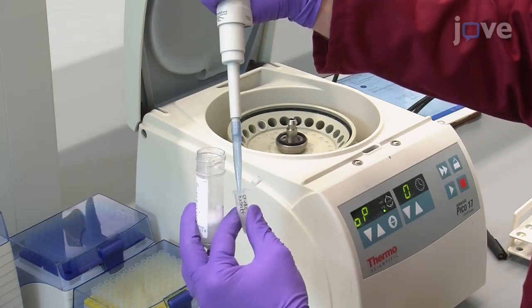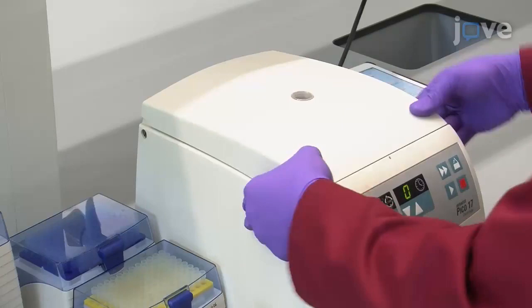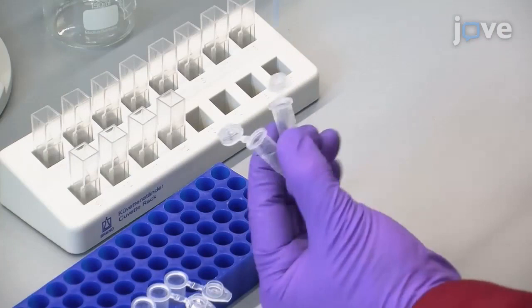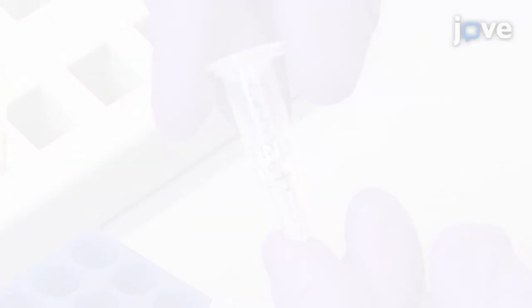Next, transfer one milliliter from the suspension to a 1.5-milliliter tube, and spin the sample for one minute at 10,000 times G to sediment the solid particles. Transfer 500 microliters of the supernatant to a clean 1.5-milliliter tube labeled lactase extract.